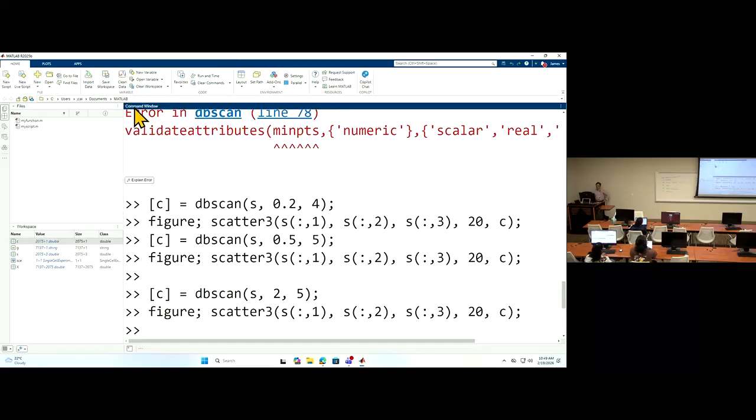Okay, so in the toolbox, through the interface, we don't have any options for using DBSCAN, but you can put this in your backup and see, okay, in some special case, maybe DBSCAN is useful. And let's see.